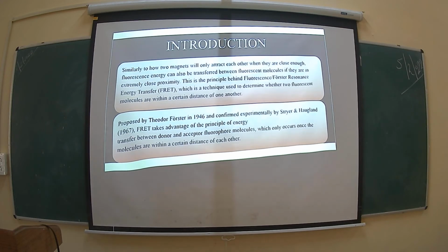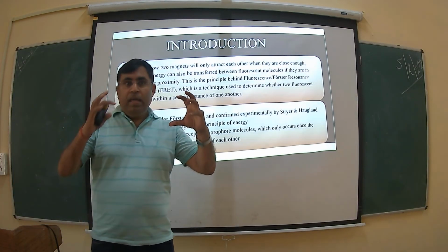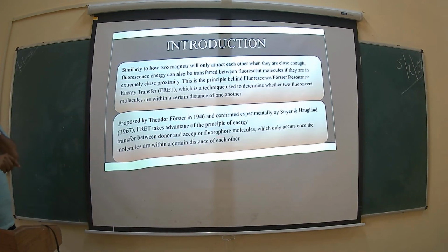FRET takes advantage of the principle of energy transfer between a donor and an acceptor fluorophore. So one is known as the donor fluorophore, and the one that accepts is known as the acceptor fluorophore. The transfer occurs once they are within a certain distance of each other.